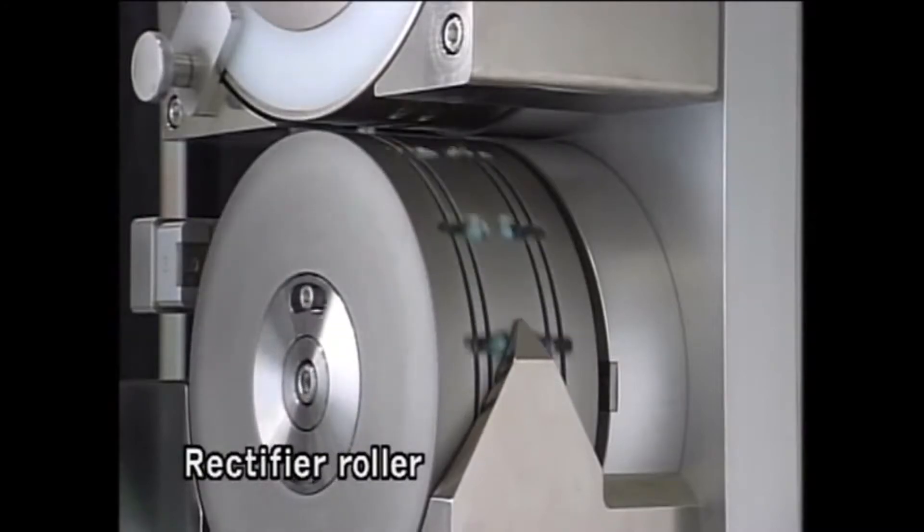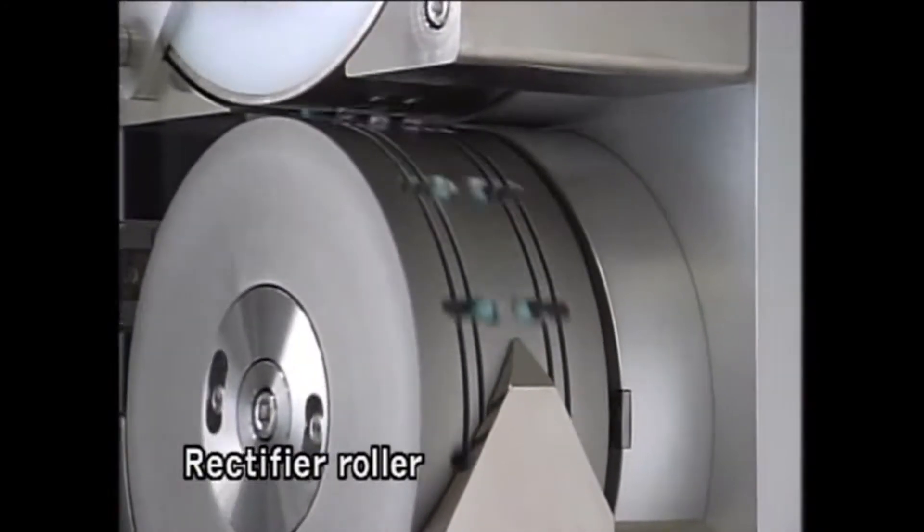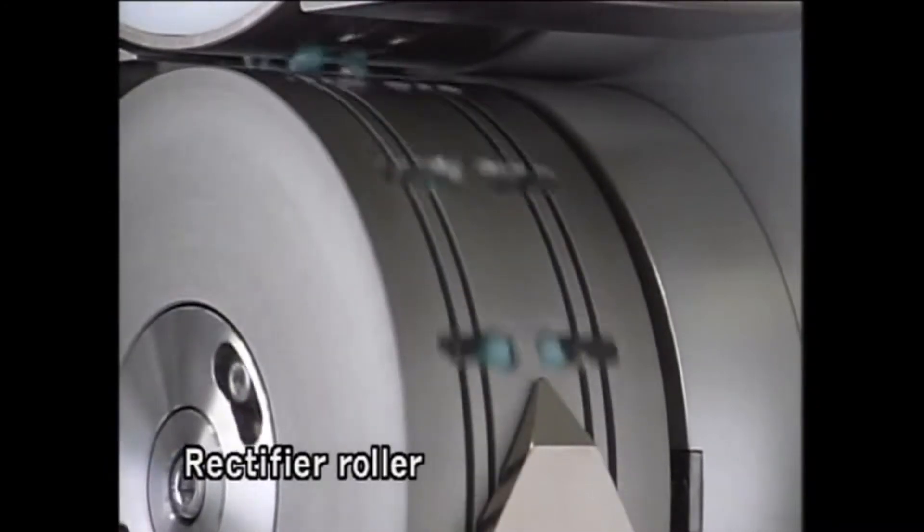There is a function to automatically remove defective products in which caps and bodies are not successfully joined by this rectifier roller.